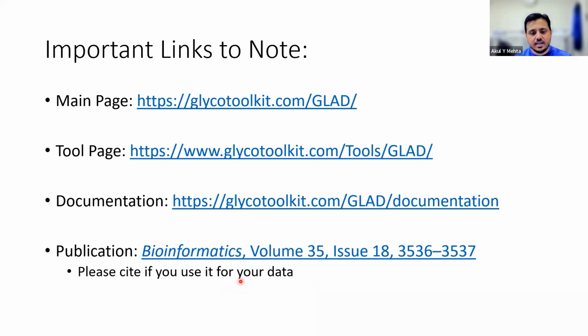And also when you cite using GLAD, please mention the version number. I will also put in the version. I'll show you where the version number is. This makes it easier for reviewers or readers who come in later to your paper to understand what version of the software they had used. All right, so we'll move to the live demo.